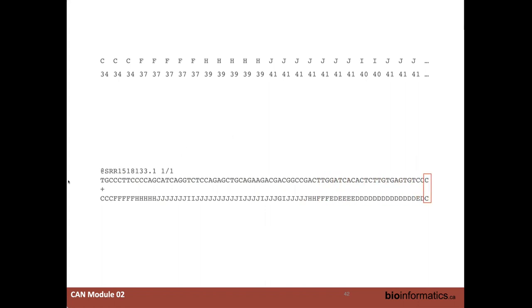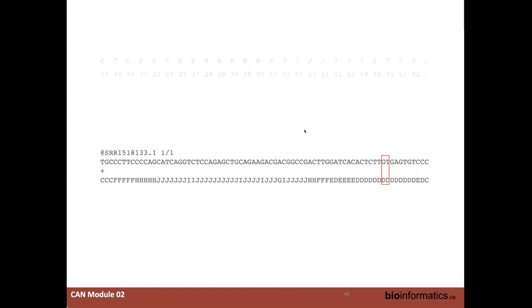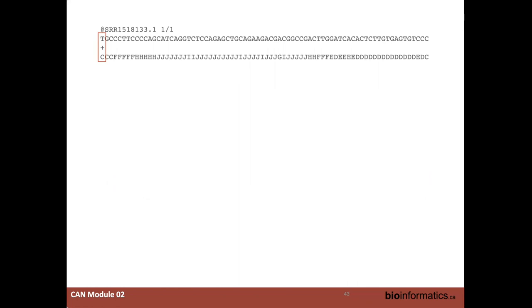While I think that's absolutely fantastic, the question really comes about: well, okay, what does this actually mean? The only reason they start this way is for simplicity. We can assign one character, which is a value, to one base. So instead of looking at that as 34 under there, we'd have this long string of characters, and we'd have to pad on some spaces to separate everything nicely, which really sucks. Someone came up with a great little equation, though: the quality score is equal to negative 10 log base 10 of the probability that the base call is done in error.